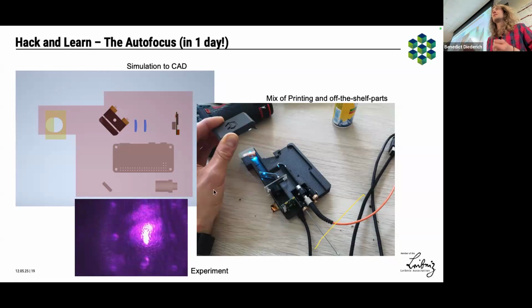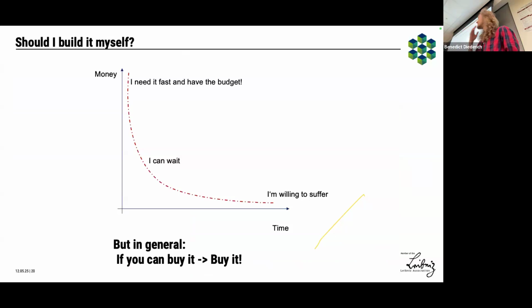But I think there is a lot of potential to just take something that's already well engineered. Maybe that's frugal, either take it directly or derive the information from either a patent or just open the box and look what's inside and then apply that to your system. And I think over the years I've done that quite a lot. And I'm not quite happy with this graph yet, but there's this thing where you can really save a lot of money. I mean, imagine a €5 device that can do autofocusing where you buy that from Zeiss for €10,000. So you literally could save €9,995.